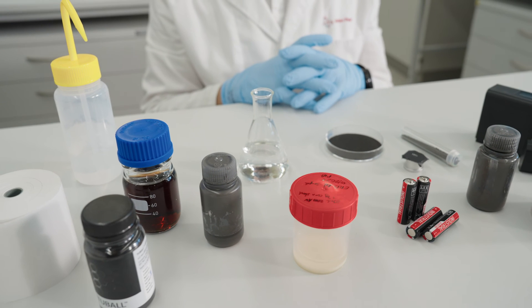For instance, using nano indentation data will help determine the lowest temperature that can be used for drying the coated slurry during electrode production. So, as we saw, surface characterization of coated electrodes — such as with scratch and indentation tests — is a quick and easy way to evaluate the quality of the coating.